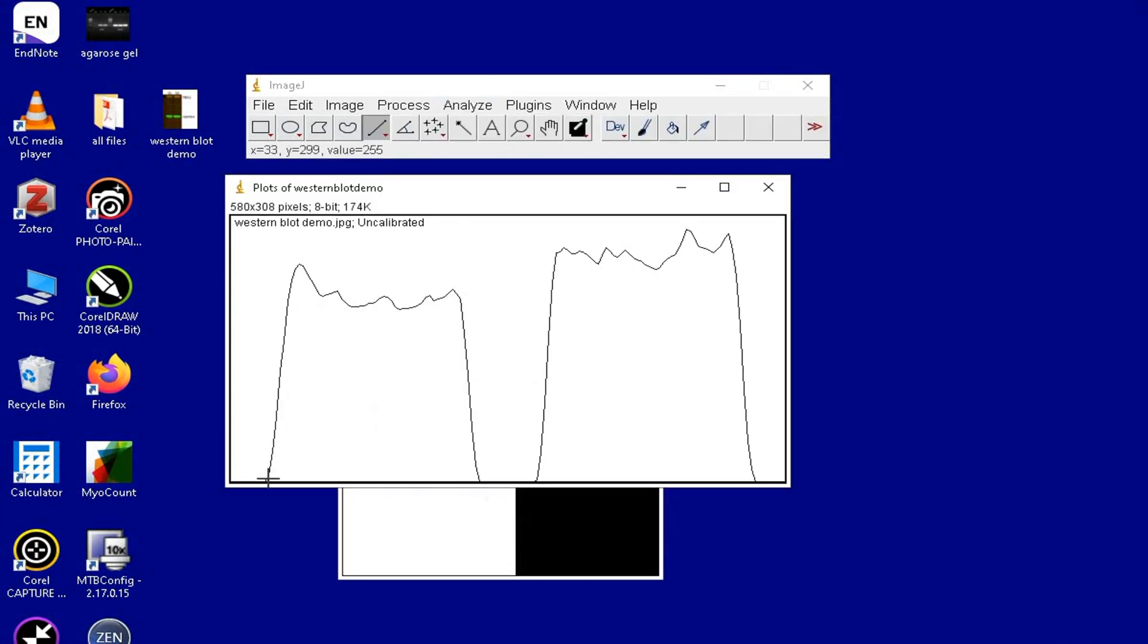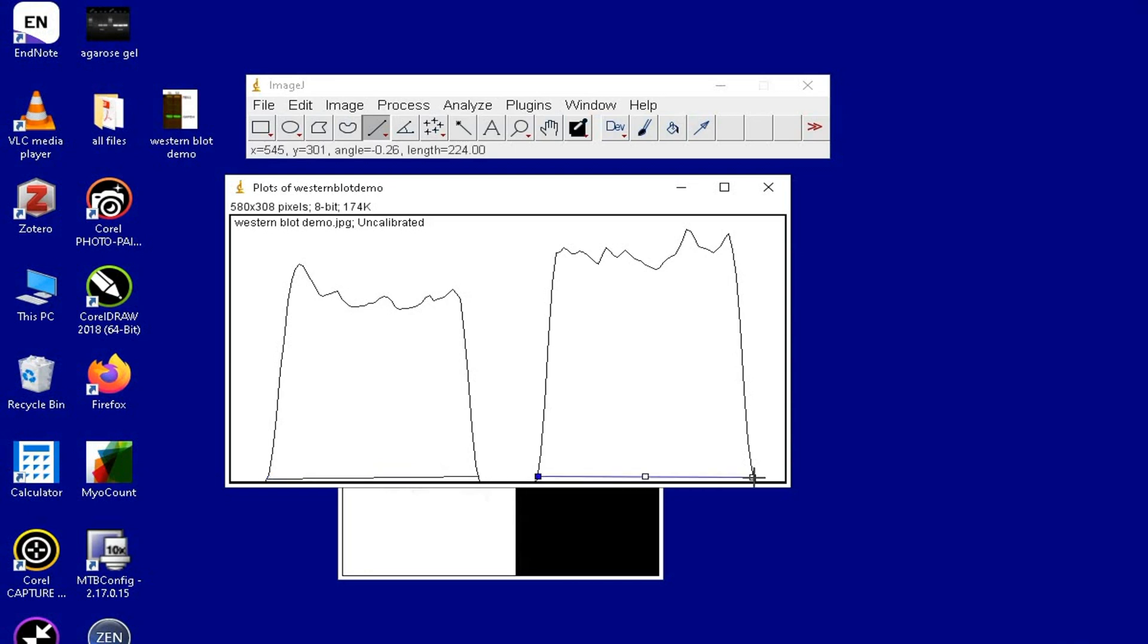The next step is to choose the line tool from above and draw a straight line connecting the bottom ends of the plotted lanes. This step displays the area occupied by the bands in the blot.